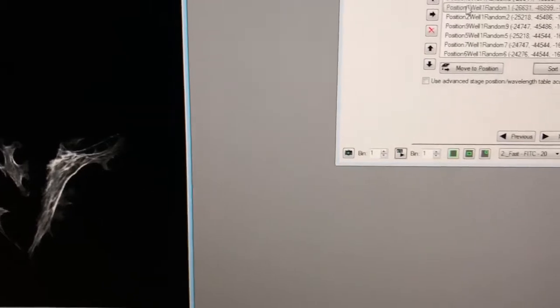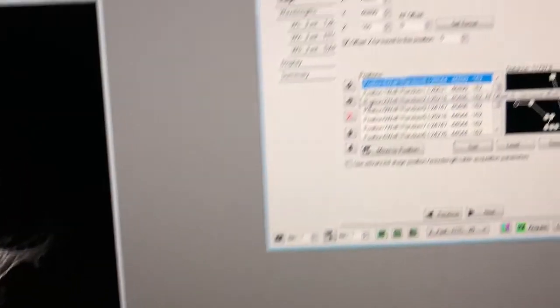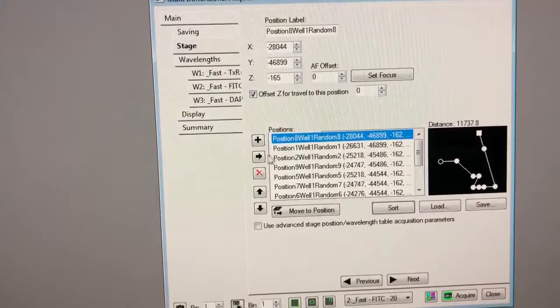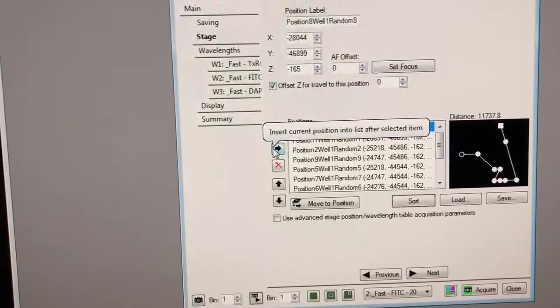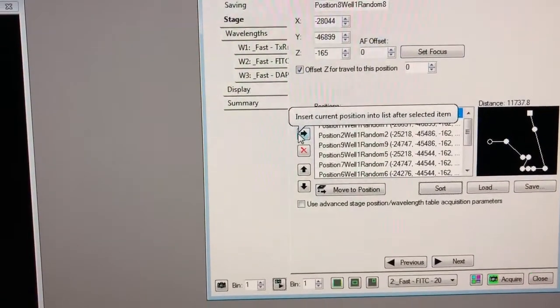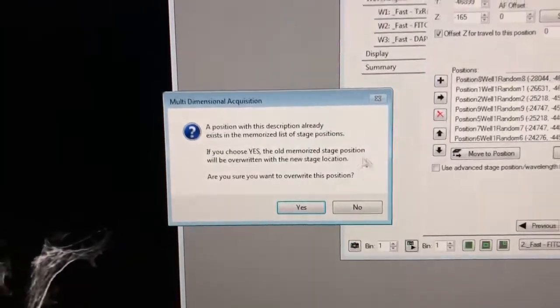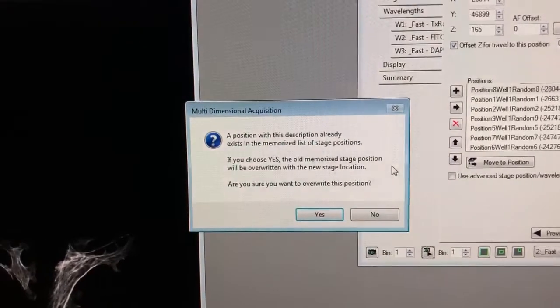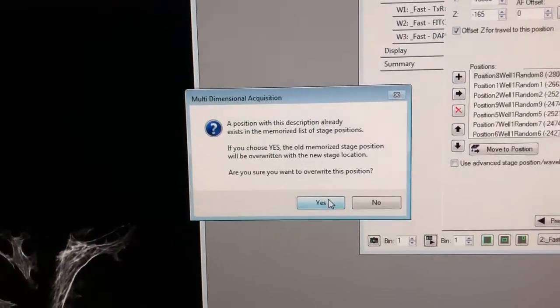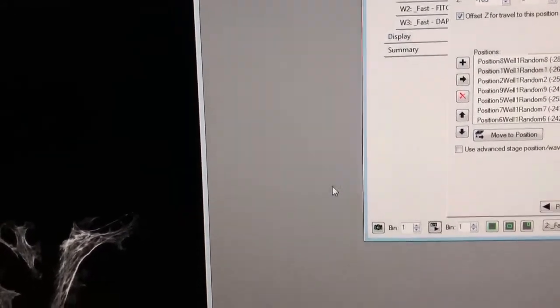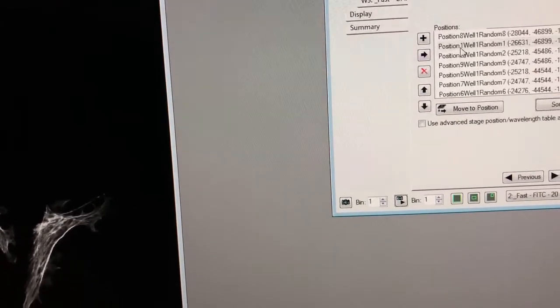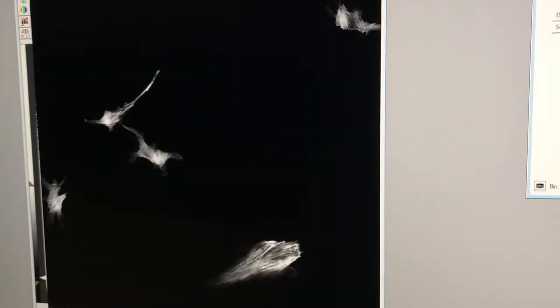You can replace this with the new position which is the same in xy but it has a different z by clicking here and it's going to say a position already exists with those settings. If you choose yes it'll overwrite it so that's fine let's overwrite it. And then you can go to other positions check the focus and overwrite them so let me show you that again. This one actually the focus looks pretty good let's go to the next one.